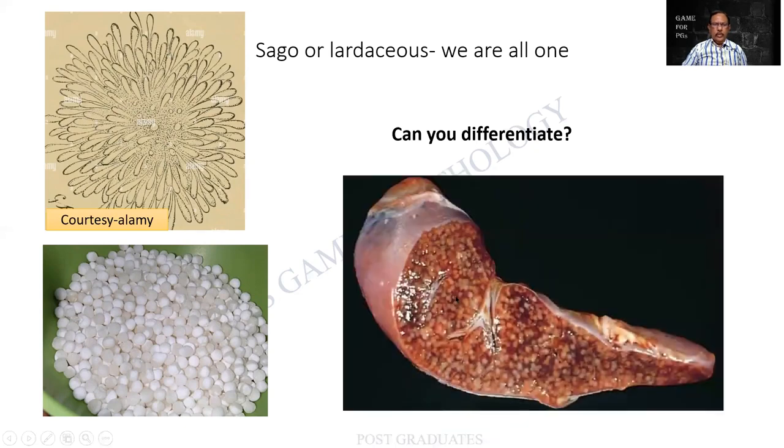And look at this over here. There are multiple nodules. You may get a specimen of the spleen. So again, the hilum is over here. There is a capsule. The cut surface is showing multiple small nodules uniformly distributed throughout. So what are all the differential diagnoses you can think of? Pause for a minute. See whether you are able to recollect the differential diagnosis. Tomorrow this might be a specimen. As I told you earlier, do not make a histological diagnosis, a rare histological diagnosis, on a gross specimen.